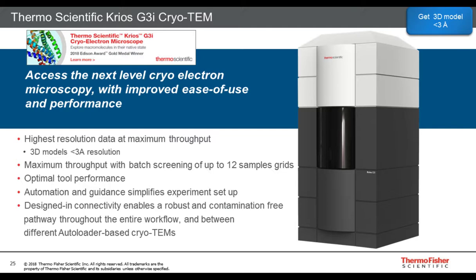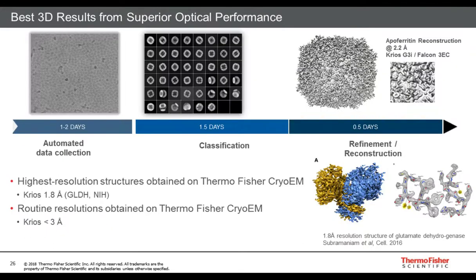But you can of course also buy your own tool set. And basically there are two different configuration flavors that you can obtain. You would advisably need a vitrification device like a Vitrobot to do the essential vitrification and fixation of the sample. The Glacios for sample optimization and screening would be advisable, and if budgetary wise it is possible, and you would definitely need it to push to the highest possible resolutions, a Titan Krios would be a nice package.